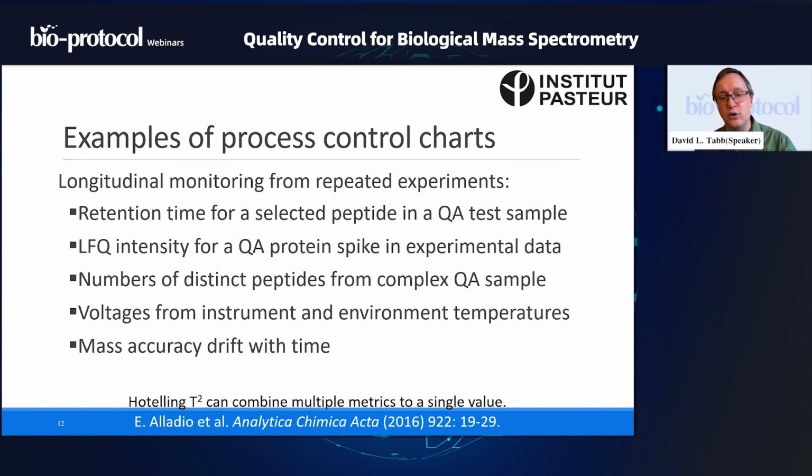So these are things that could give you process control charts that are very valuable to understanding whether the instrument was behaving itself or not. I've mentioned at the bottom, and again, it's hidden by the Zoom bar for me, but Hotelling created a strategy by which you could combine together different kinds of metrics and track those over the course of time. So maybe you have 20 different features that you're measuring for this instrument, and you're able to put them all together, thinking that if something goes wrong in the instrument, multiple measures might together vary to reflect that something has gone wrong.